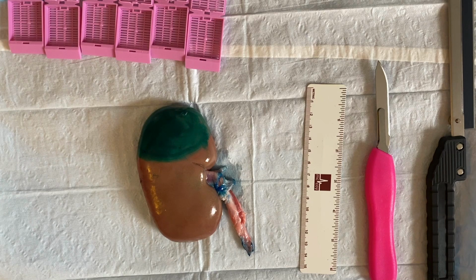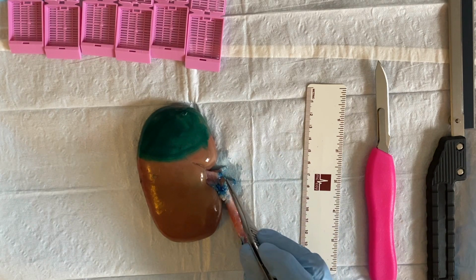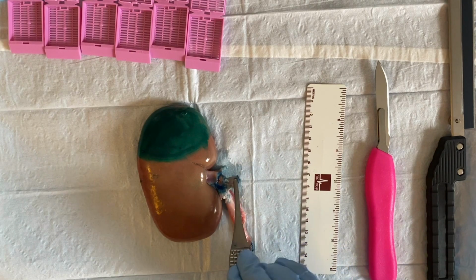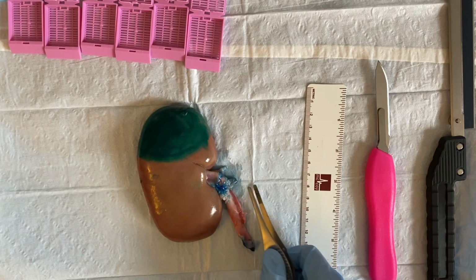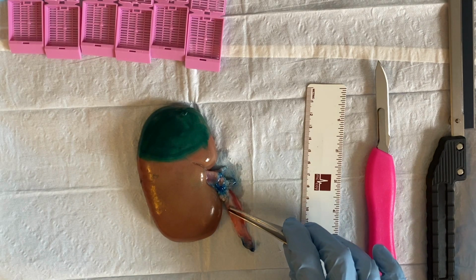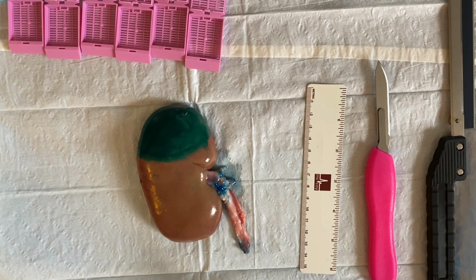The renal vein is the most anterior vessel that is present, and I have inked that here, which I'm opening right now with my forceps. The renal artery is posterior and superior to the renal vein, and the most posterior and caudally coursing structure is the ureter. That's what's present here and is inked blue. All of these structures can be inked the same color since they look different under the microscope.